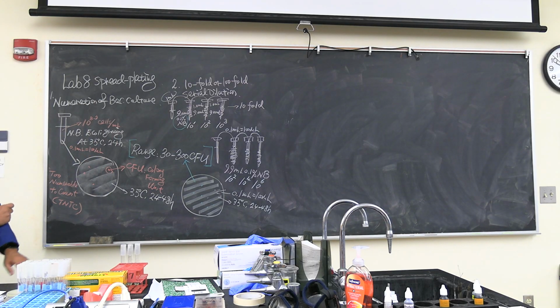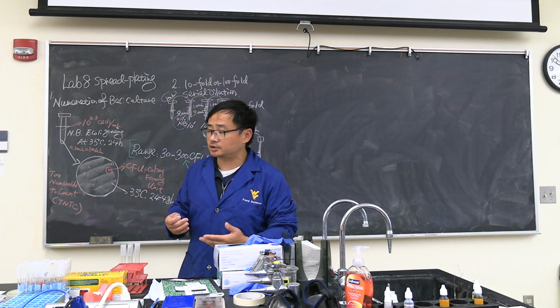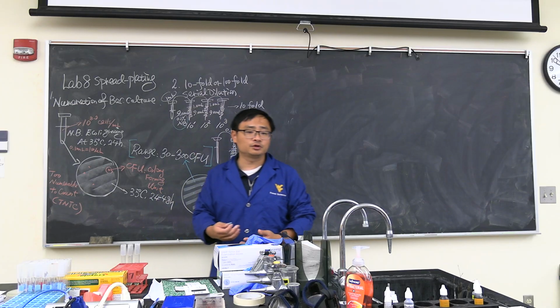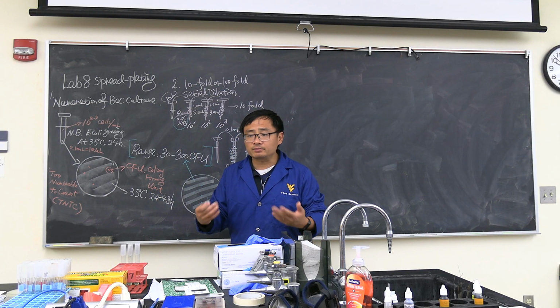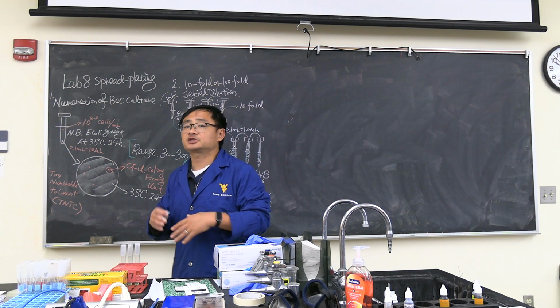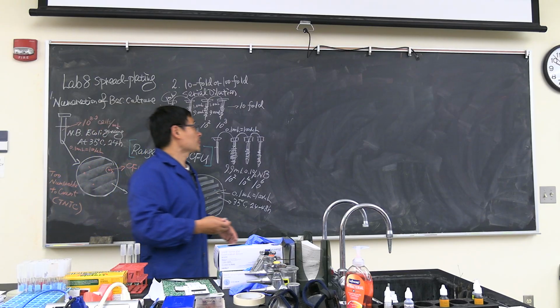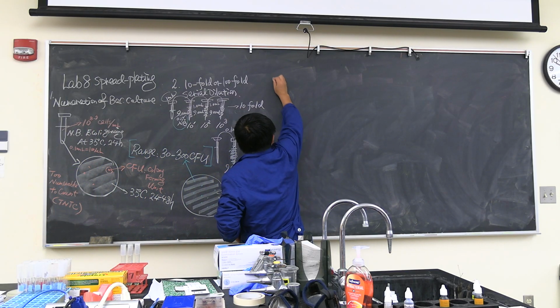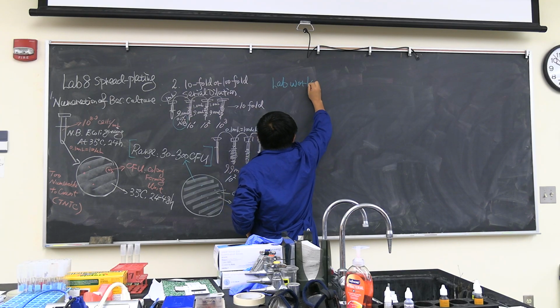Okay. So this is an overview picture of what we're going to do. Today is the first time you do spread plating, and the first time here we do serial dilution. I have been working for many years, so we want to make your life a little easy. So I'm going to set up the dilution sketch, and then you do it. Okay. So how are we going to do the work today? Everybody will do it individually.